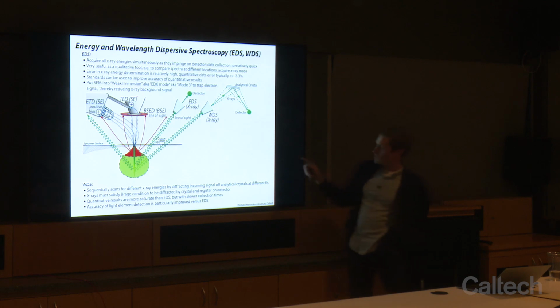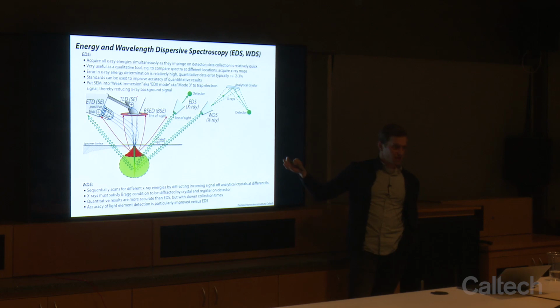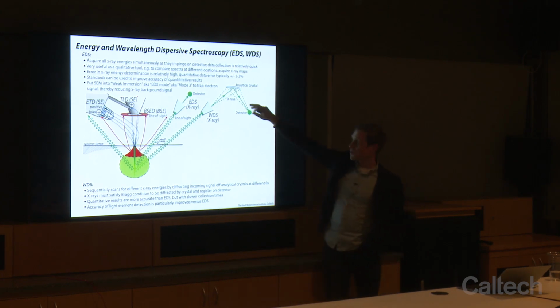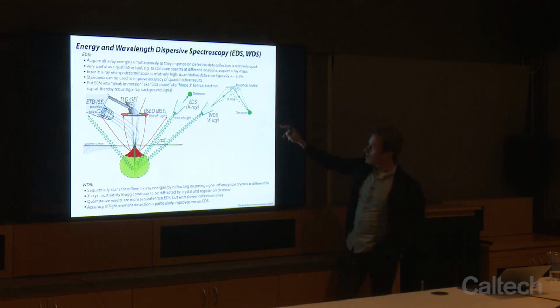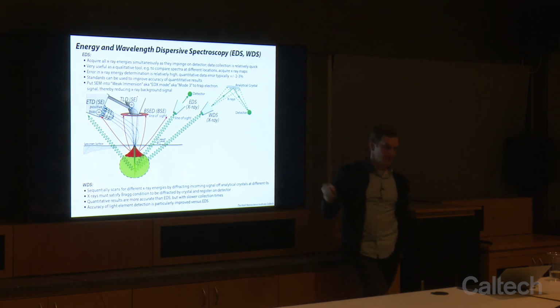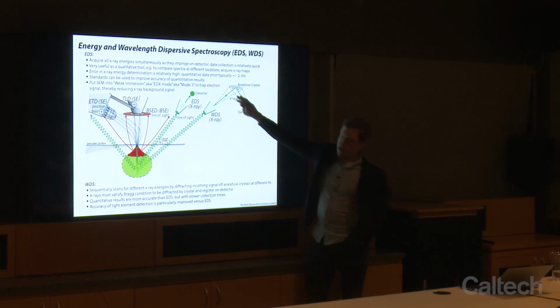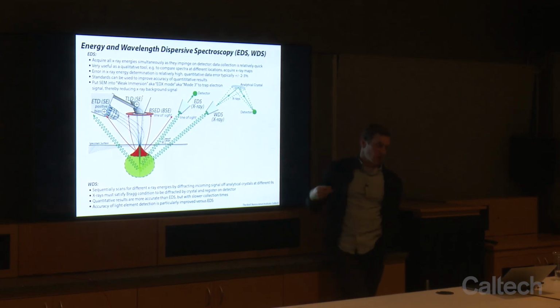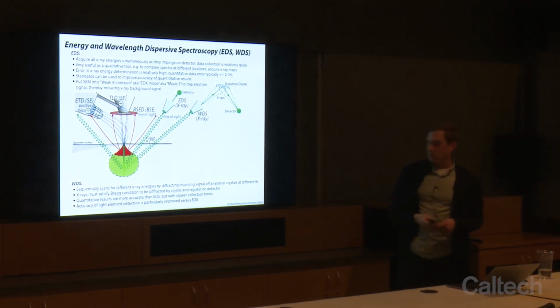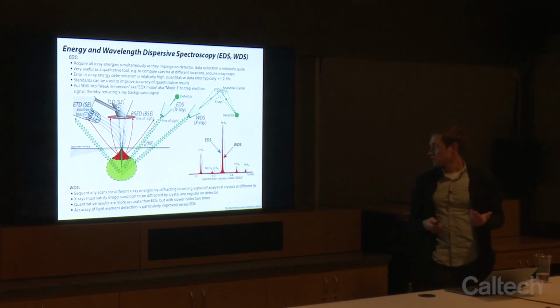And then in wavelength dispersive spectroscopy, we have an analytical crystal, or usually several of these. And what we do is we sweep an energy range. So we can change the crystal, we can change its angle, and what we ultimately do is, if we're trying to filter out and say how many counts or how many X-rays we have at a certain energy, only those X-rays that satisfy the Bragg condition and diffract and hit the detector will get counted. So we slowly cycle through all the energy, and therefore we're able to get ultimately what is a higher resolution spectrum.